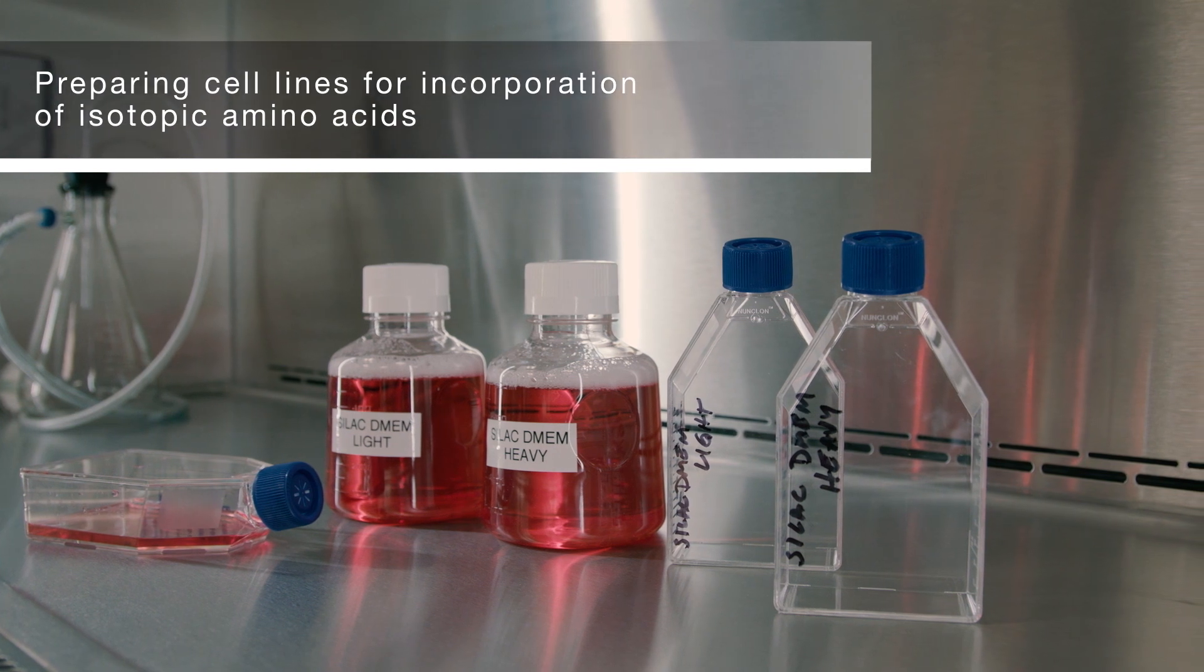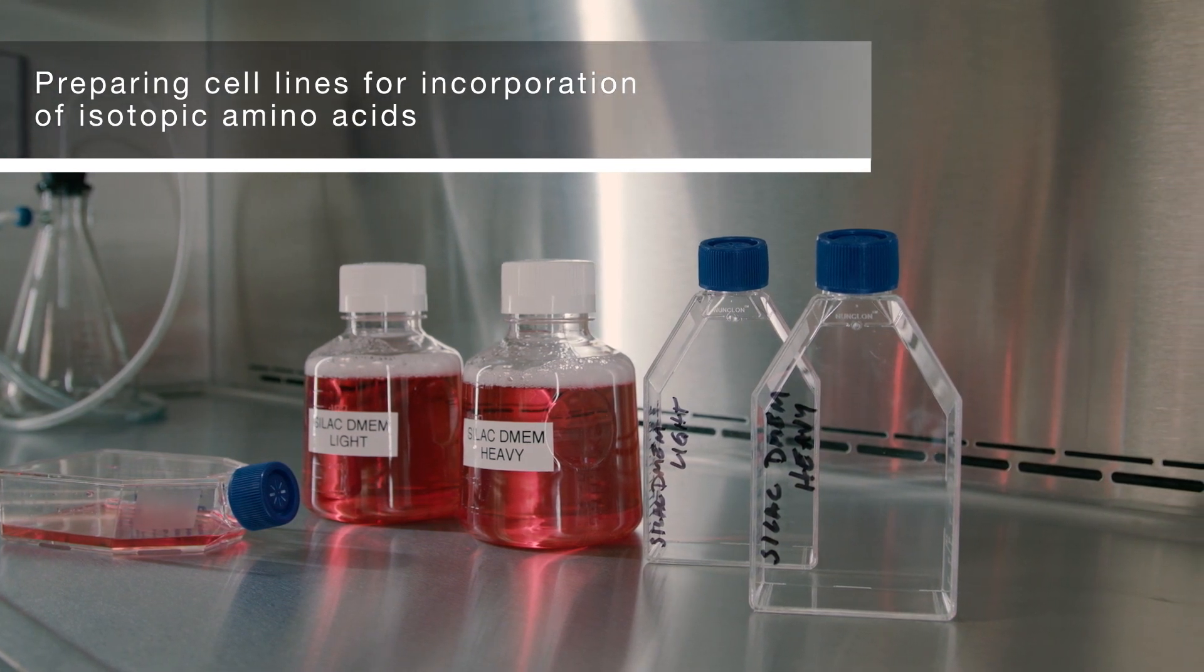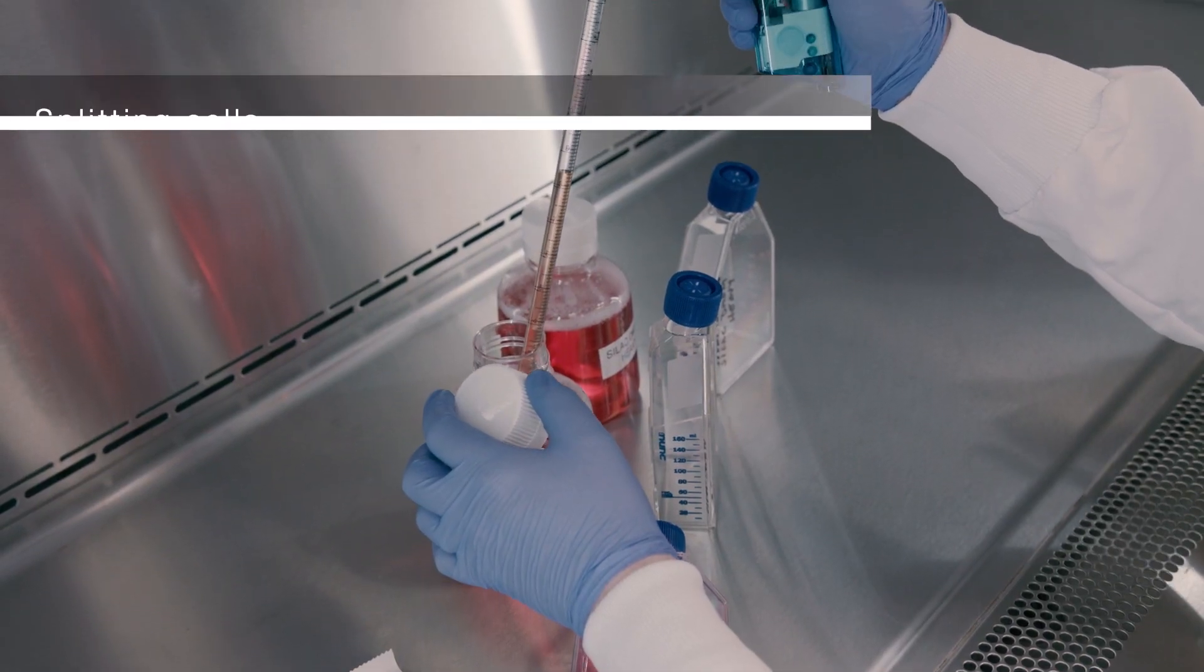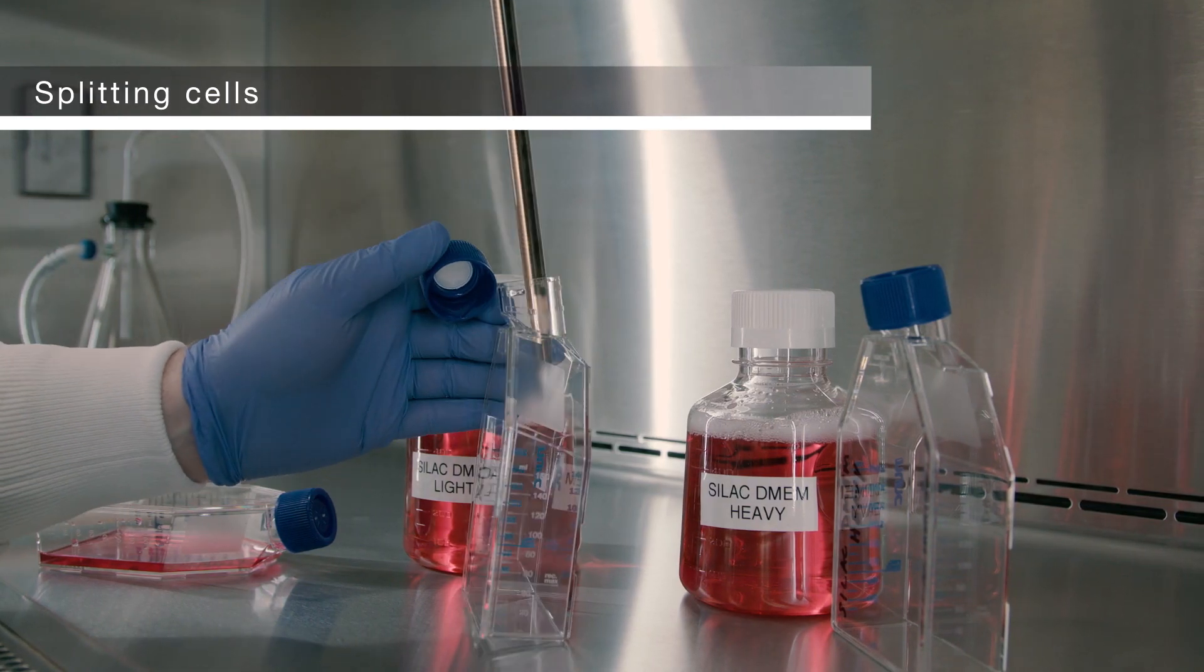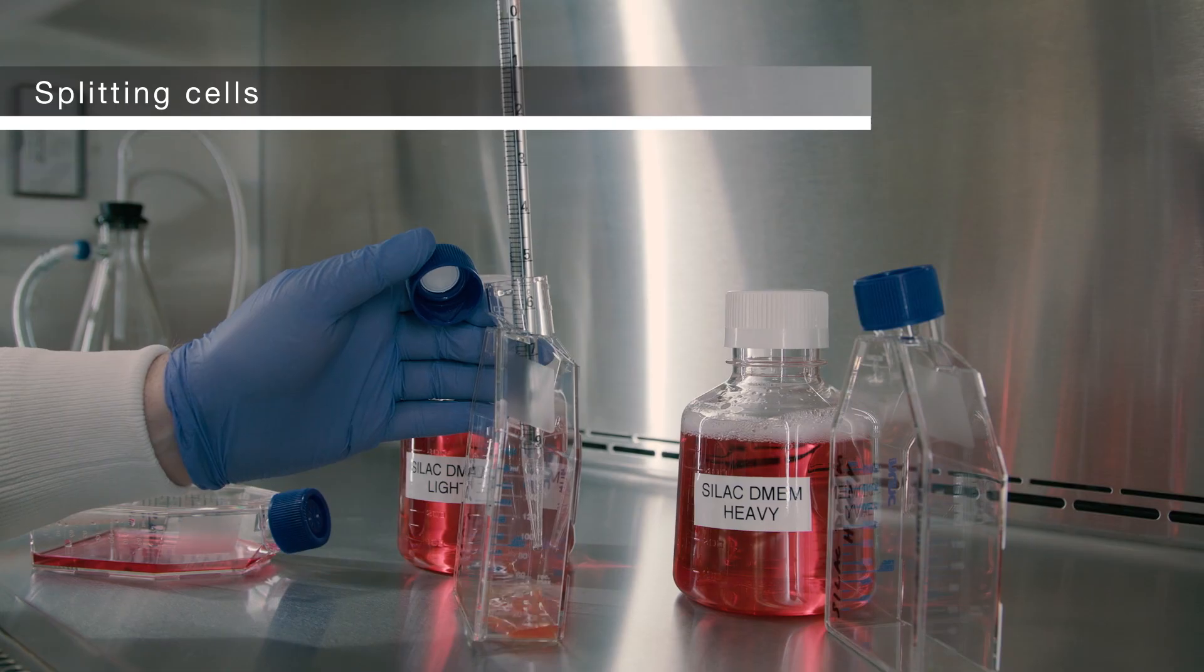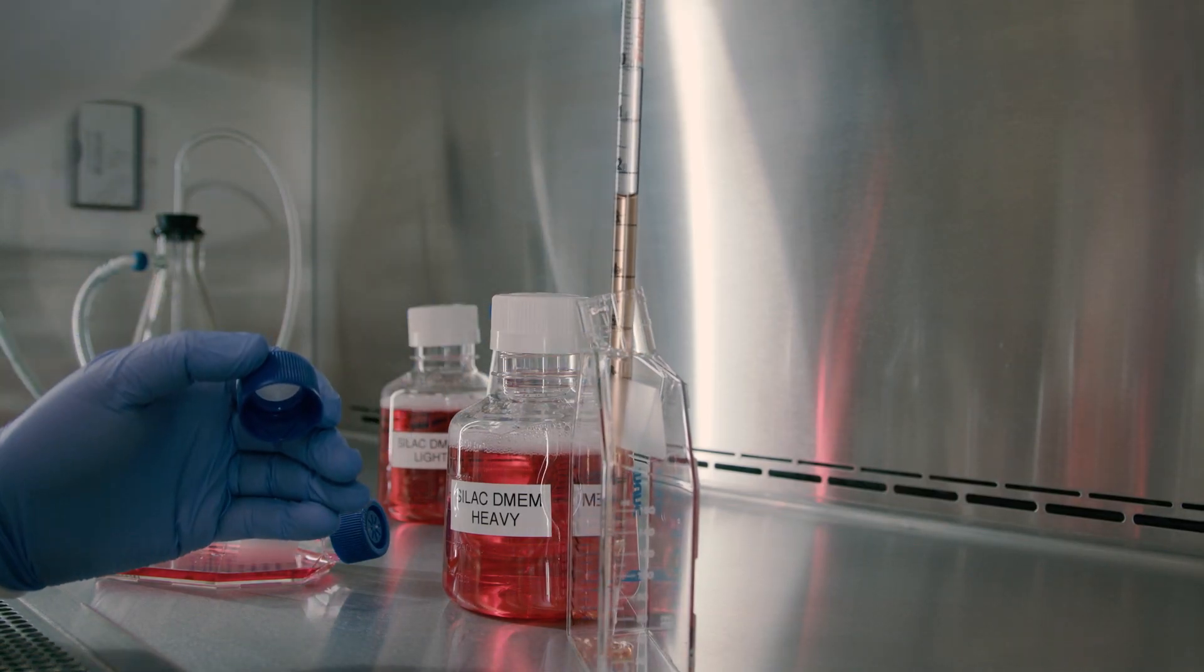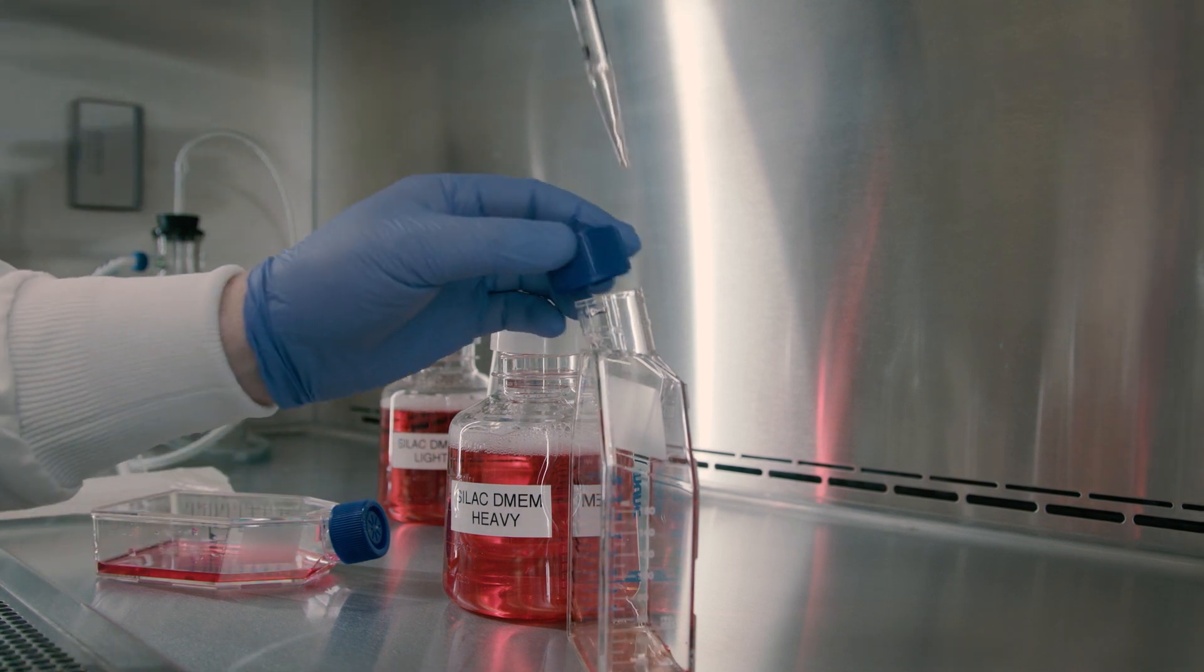The next step is to prepare your cell lines for incorporation of the isotope labeled amino acids. Depending on the cell type, split between 100,000 and 200,000 cells adapted to grow in the specific medium type into two or more tissue culture flasks or plates, with one containing the heavy medium and one containing the light medium.